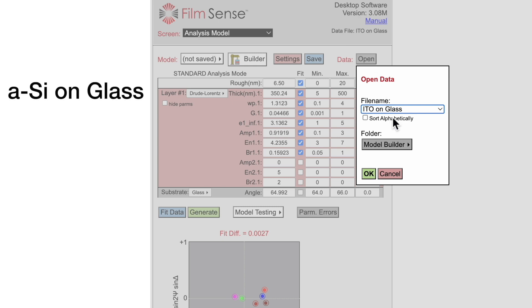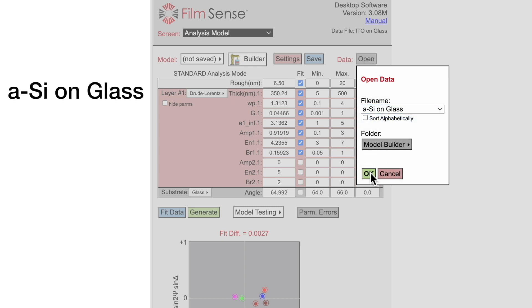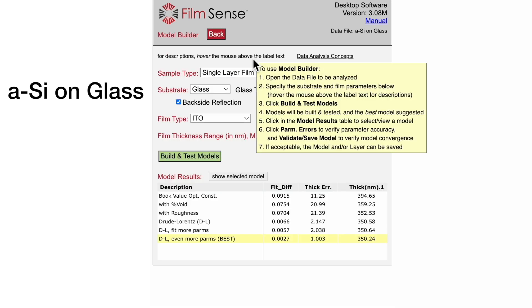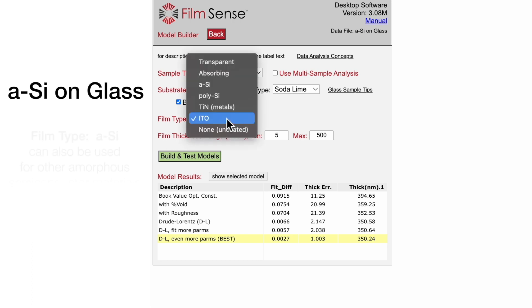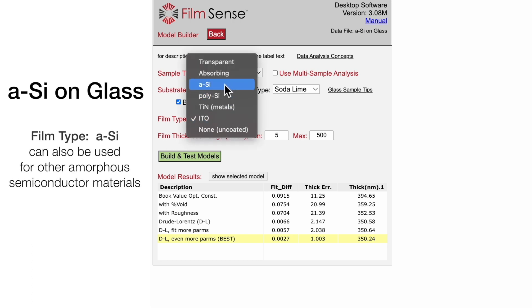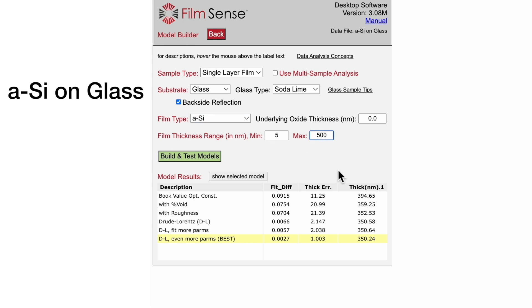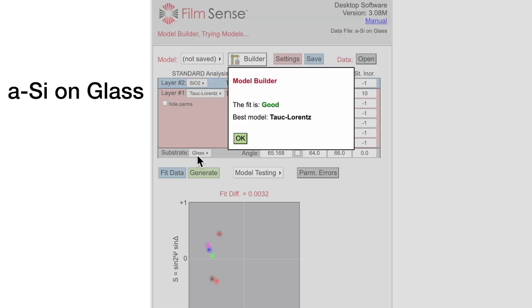Amorphous silicon films provide another good example of using oscillators in the ellipsometric data analysis model. For this sample, the substrate parameters are correct, but I will need to change the film type to amorphous silicon, and also increase the film thickness range to 600 nanometers for this sample. Then we will build and test models, and the best model uses a Tauc-Lorenz oscillator.